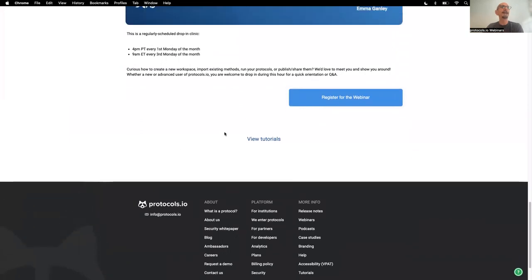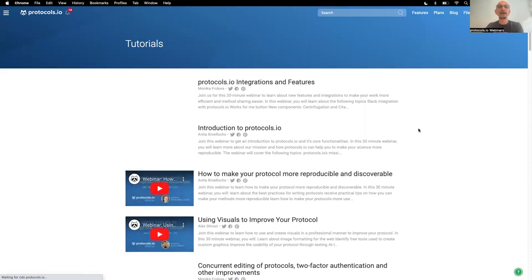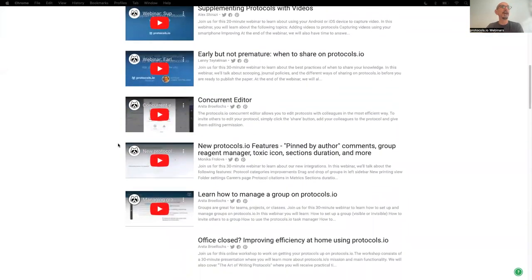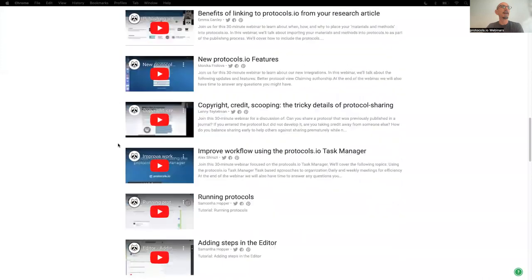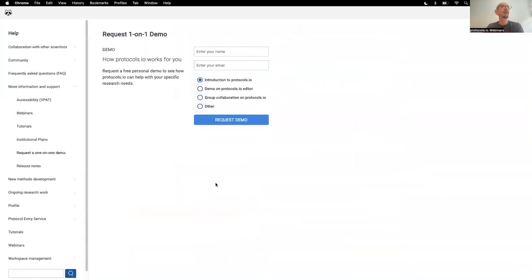We also have a series of pre-recorded tutorials about the different tools and functionalities of protocols.io. And if you scroll all the way down in this web page, there is a link here to request a one-to-one demo with one of us. So these are the different training resources that you can browse for more information.